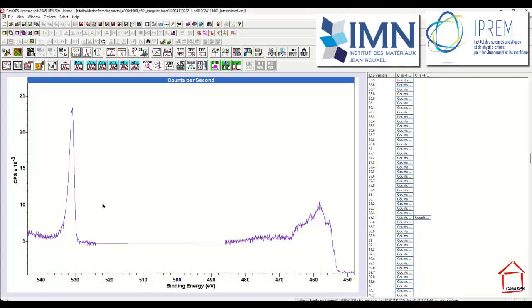The reason I believe this to be a plausible spectroscopic component is because whenever I've seen other experiments involving titanium, for example a multi-layer silicon dioxide titanium dioxide material sputtered, I've seen this type of shape appearing within the titanium. So this shape is certainly a plausible spectroscopic shape for a form of titanium that has been damaged through the use of an ion beam and is relating to an amount of oxygen. So I'm going to take another copy.